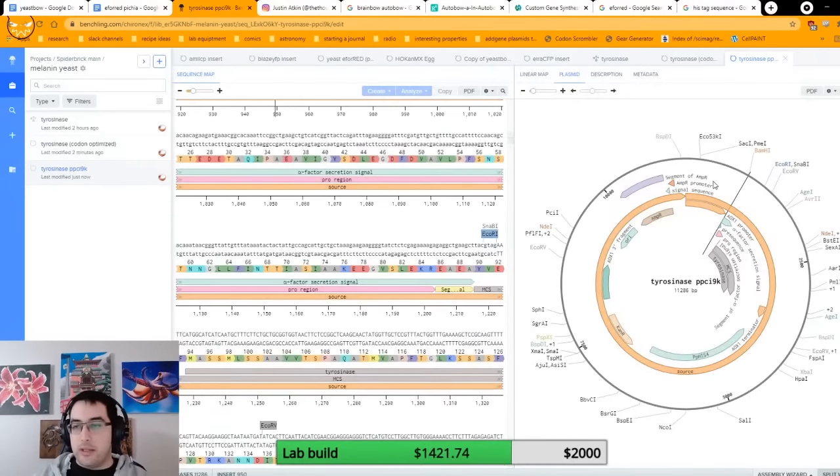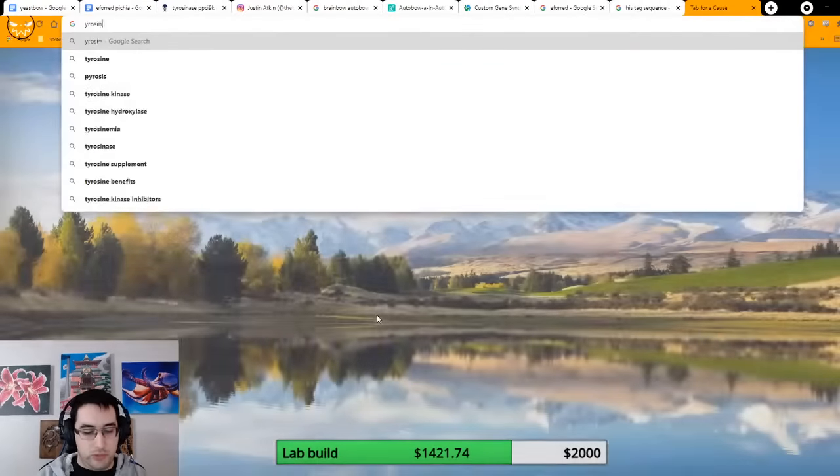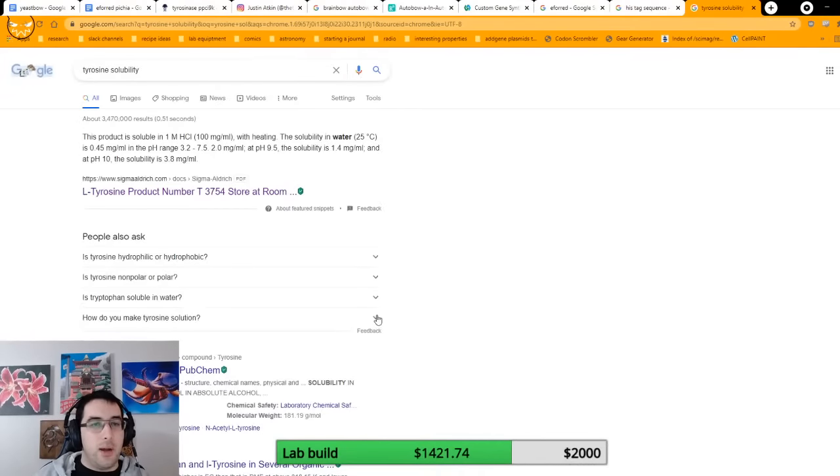And because of the backbone that I'm using, I just happen to like this one. It's going to secrete this enzyme. So basically the media around the yeast is going to fill with this, because one of the issues was that tyrosine is hilariously insoluble. Let me just elucidate how insoluble this is. In regular water, it's soluble at 0.45 milligrams per milliliter.